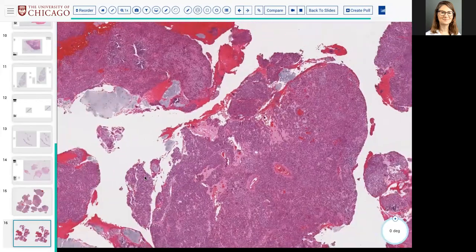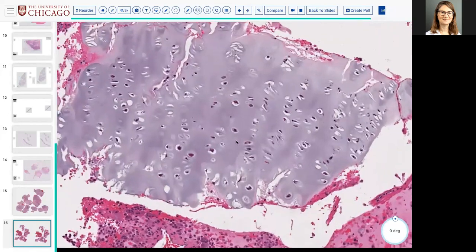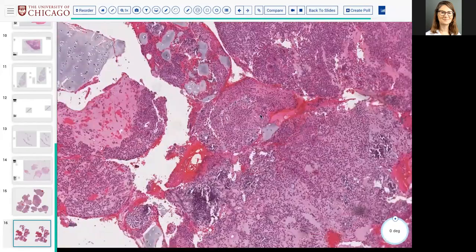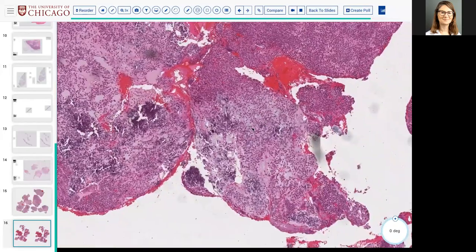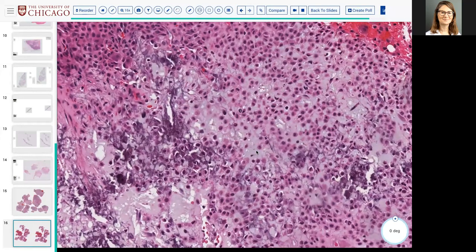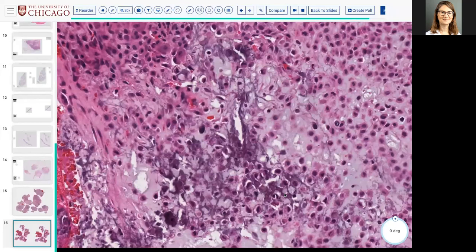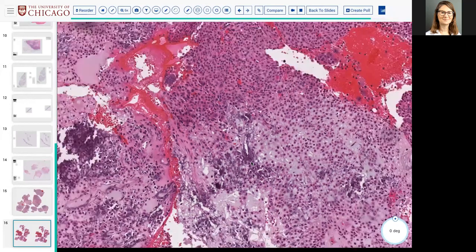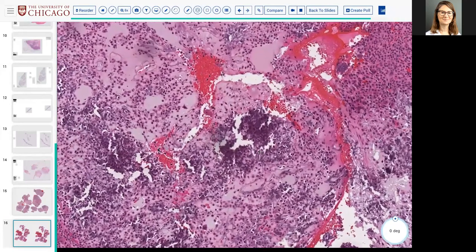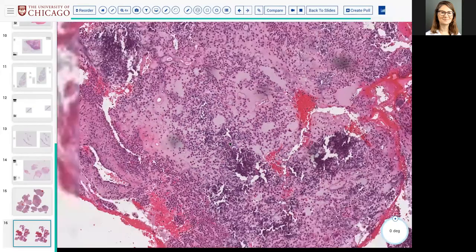The other features that will certainly aid are the presence of neoplastic cartilage, as well as fine calcification of that cartilage. Here's a nice area where you get some expansion of the stroma between these cells, with that glassy chondroid, hyaluronic acid type of look. Then that cartilage starts to calcify such that it surrounds each of the individual lacunae of these chondroblasts, resulting in that chicken wire appearance. So, a nice example of a chondroblastoma, giving you all of the characteristic features.